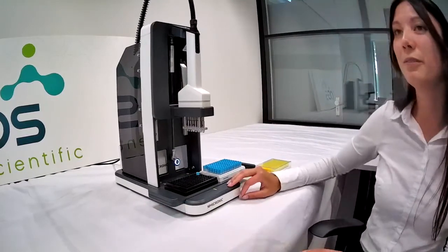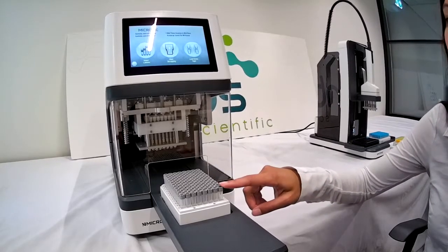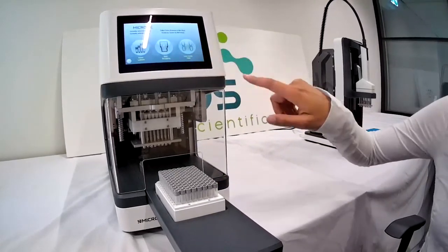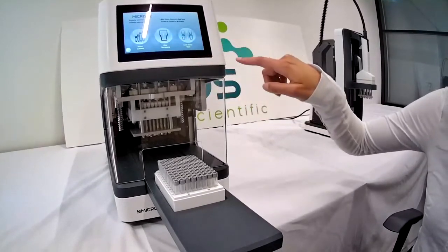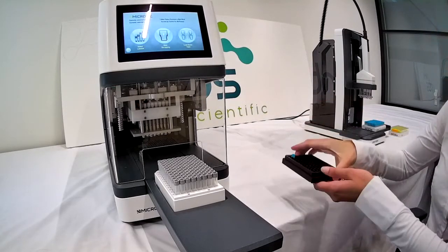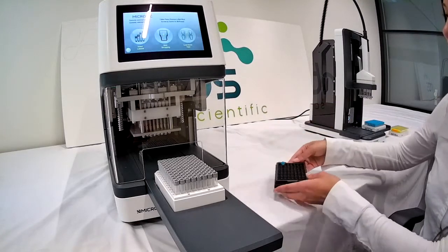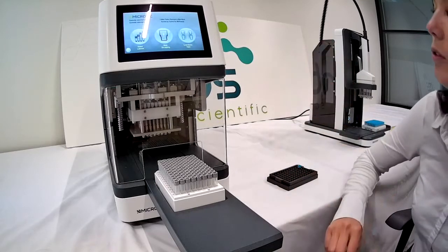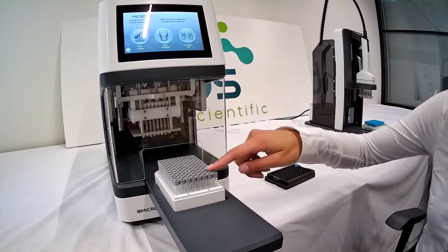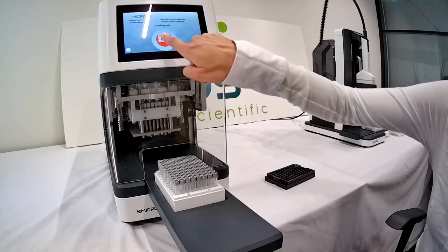Then we also have an automated system. We have a rack of 1.4 ml tubes in here with an external threaded cap. You have two options to start: decapping, or loading the screw caps. You can also have your screw caps on a refill carrier, and it takes the screw caps from the recap carrier and puts them on your tubes. But for now, the caps are already on the tubes. So we're pressing the middle button, start decapping.